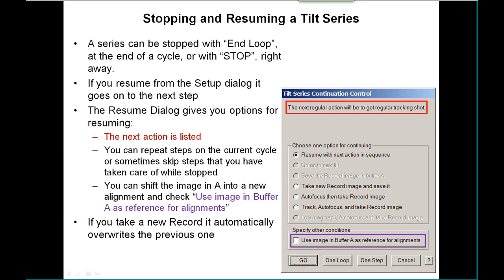Dialogs available with tilt series once you've stopped. When you're running the tilt series, you'll see both the End Loop button and Stop button. Stop will do a dead stop on whatever is going on. End Loop will stop at the end of taking a record image at the end of the tilt. When you resume from the setup dialog, you don't go into this resume dialog—it just goes right on to the next action.